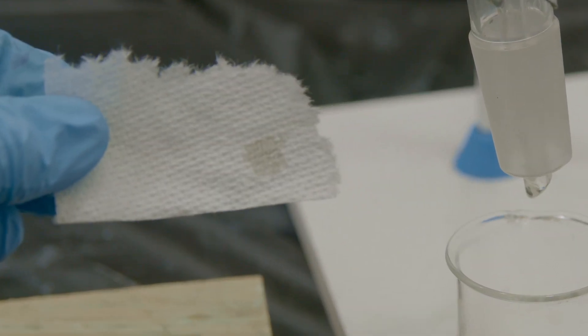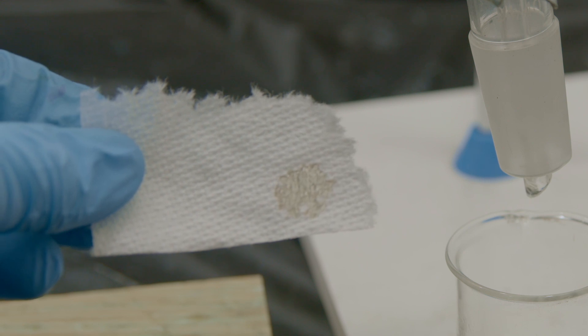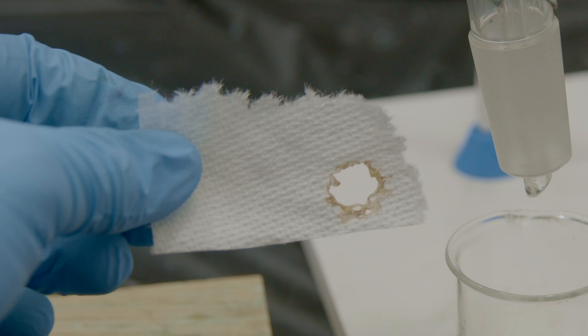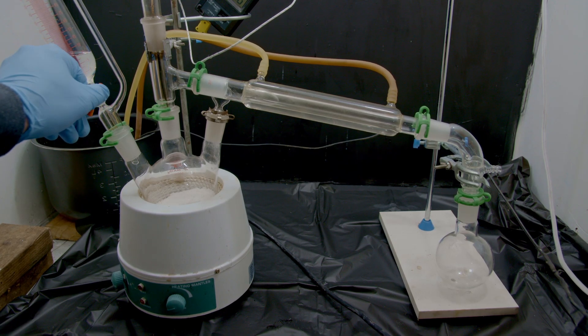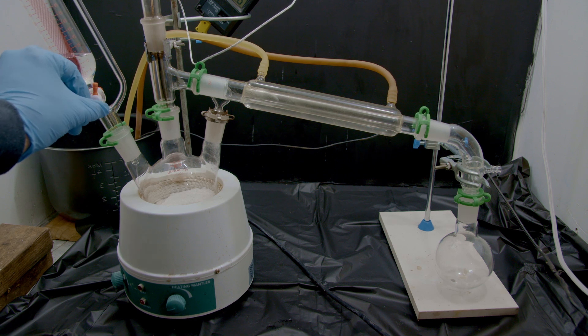You know your acid's good when it eats straight through a paper towel. So for the final step we set up for distillation and we slowly add the sulfuric acid to the sodium acetate drop wise.